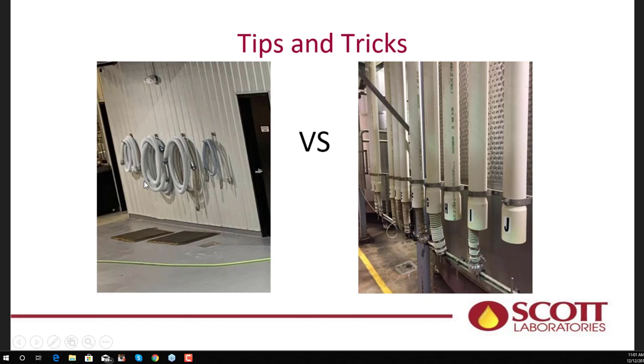And what happens is wine, diluted water will end up hanging out right here, and you'll have a lot of microbial growth right there. What I've also seen is hoses that people will drape across four of these little hose hangers, and they're still draped and there's a low spot in between each one of them. You really want to try to avoid that. Something like this, there is no place for the microbes to hang out and pool and fester. So this is a really good system.